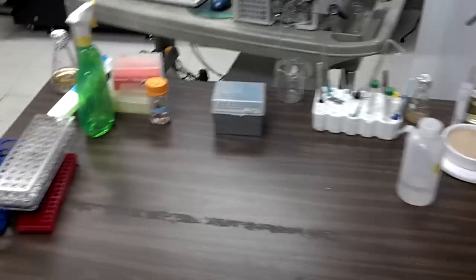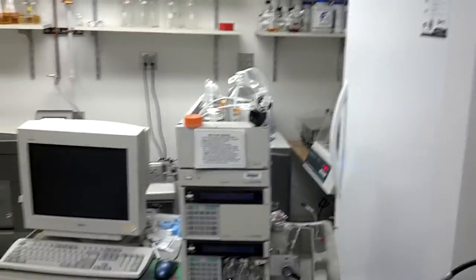This is the table where we inoculate our cells. It's another analytical machine which I do not know what it is.